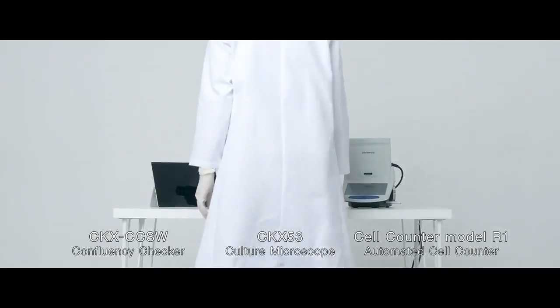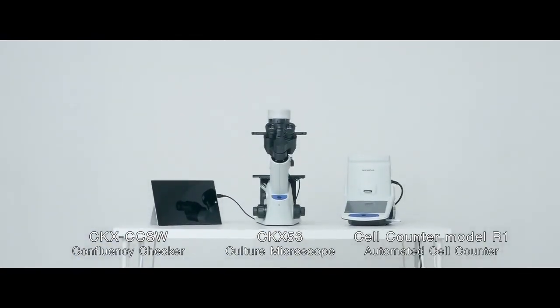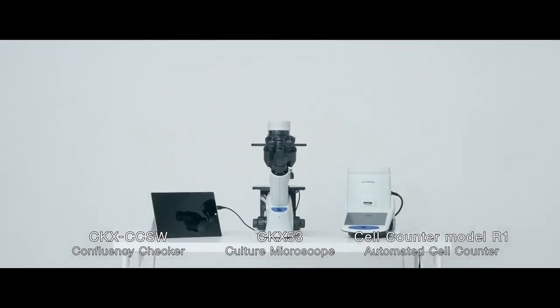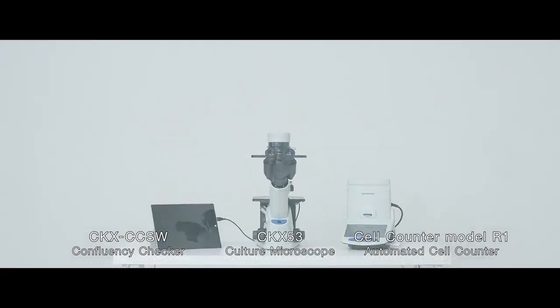The Olympus CKX53, CCSW and Cell Counter Model R1 save time and improve accuracy for all cell culture processes.